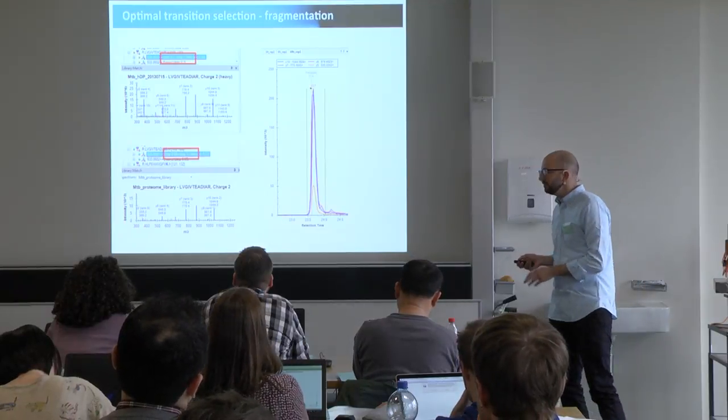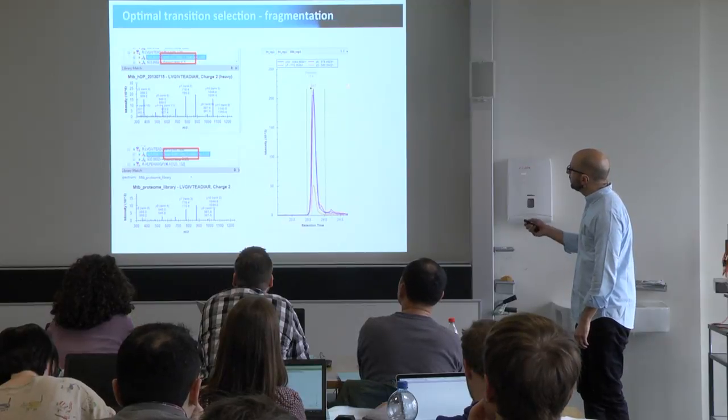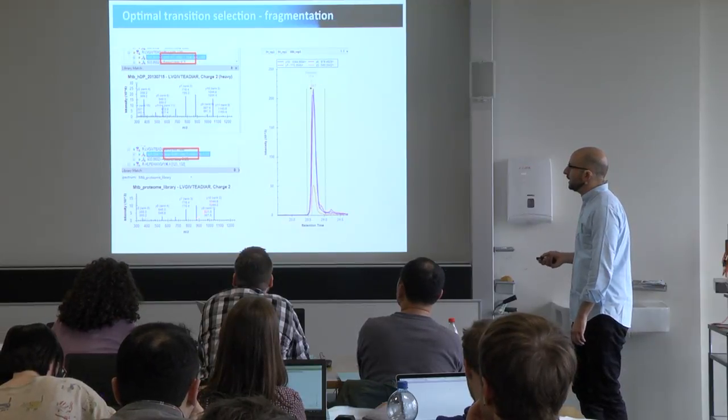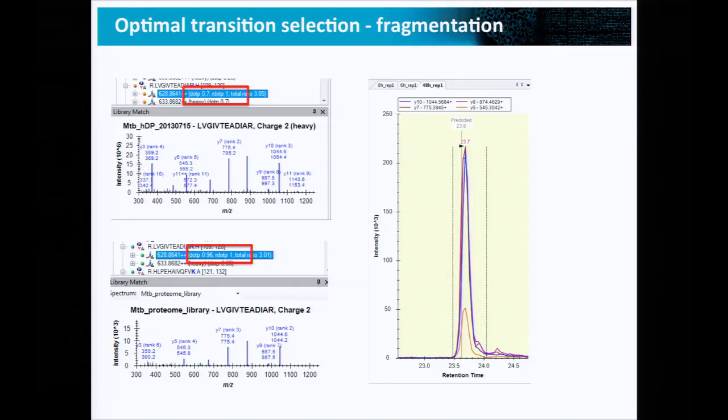And just to give you a practical example, this is from the material that you have in the course. We have a certain peak that we measured. We measured here 4 transitions, and all I did, you'll have soon enough 2 libraries, was to go to this peptide and activate 2 different libraries. So this is one library and this is another library. These libraries were generated a bit differently, so the fragmentation was a bit different. And what I hope you can see even from the back is that here the dot product is 0.7, and here the dot product is 0.96.